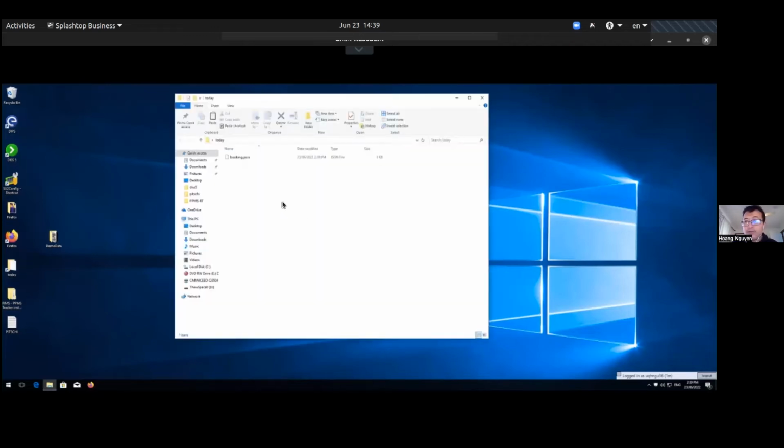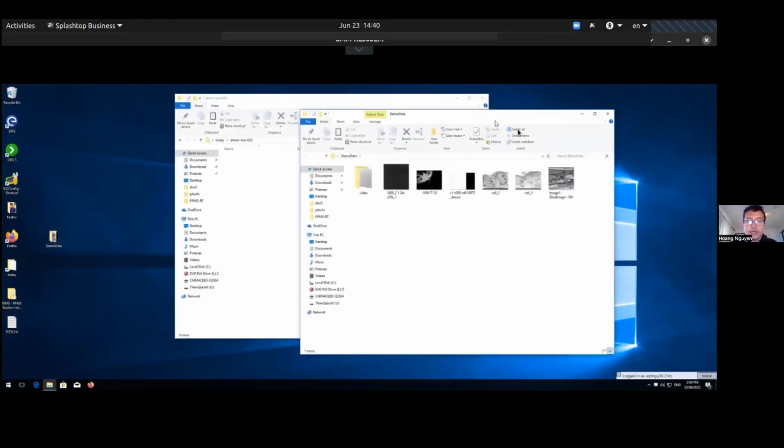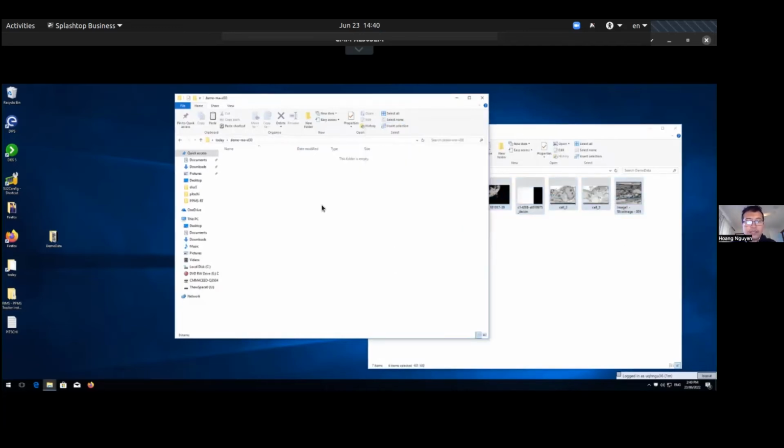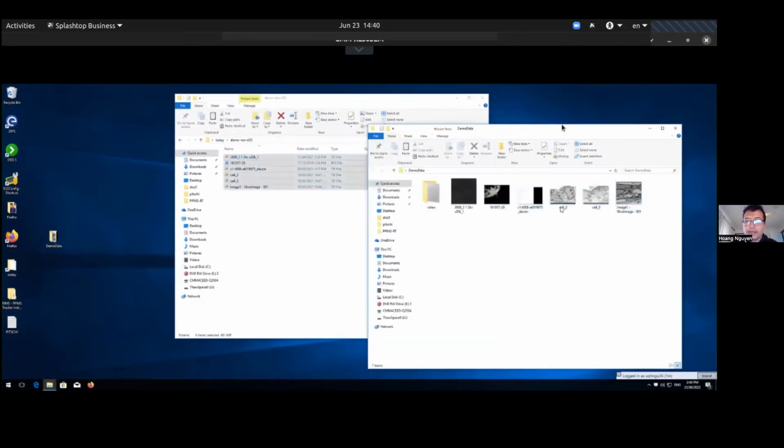To save the data, I need to create a folder, let's say DL demo MA XL30, for instance, and then the user needs to tell the acquisition software to output the data here. Because I'm not actually using the machine, I just copy a couple of images that I prepared beforehand. So it's nothing serious.